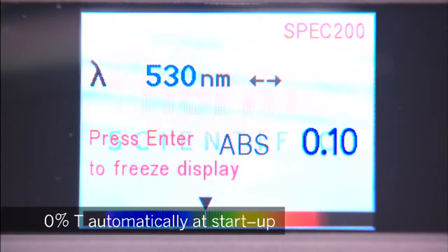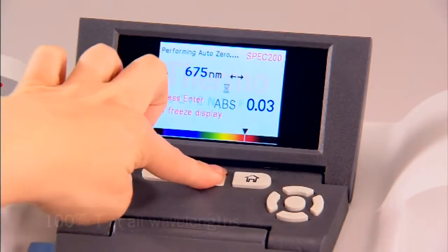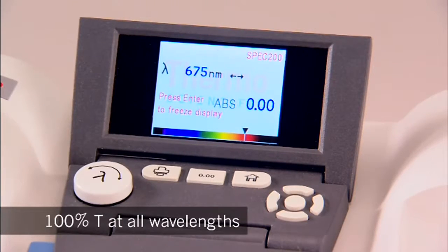0% T measurement is done automatically at startup, and the AutoZero function records 100% T at all wavelengths.